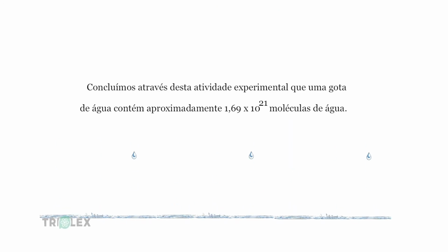In this experimental activity, we learned that there are approximately 1.69 times 10 to the power of 21 molecules of water in a single drop of water.